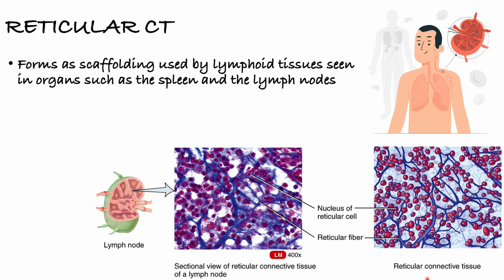So you can see here the nucleus of the reticular cell, and we're going to see a lot more reticular fiber, that I mentioned earlier. We're going to see that here.